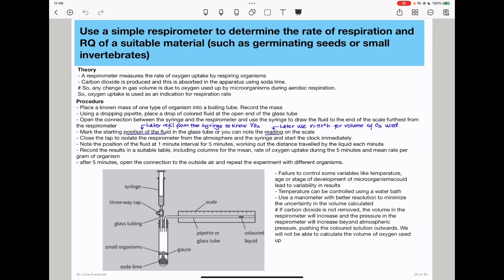You need to know that if carbon dioxide is not removed, the volume in the respirometer will increase. Pressure in the respirometer will increase beyond atmospheric pressure, pushing the colored solution outwards, and we will not be able to calculate the volume of oxygen.